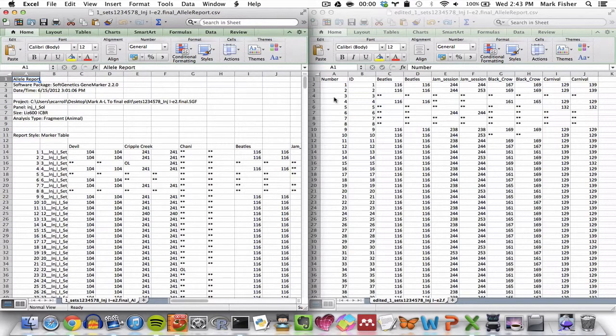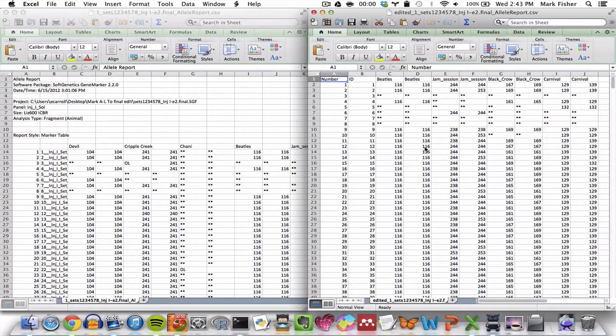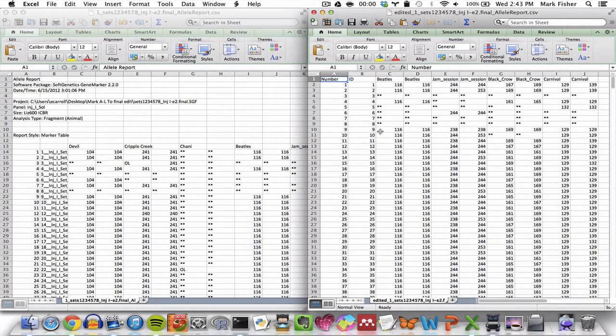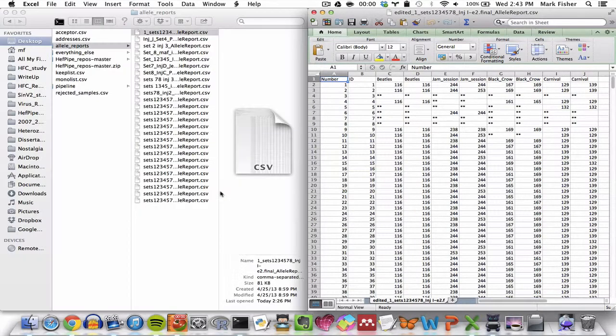It also removes all loci that aren't in the keep list in the loci you want to use. So the first starting locus in our case in the example data, it's beetles and not devil. So those are some of the differences between the edited allele reports and the original allele reports.